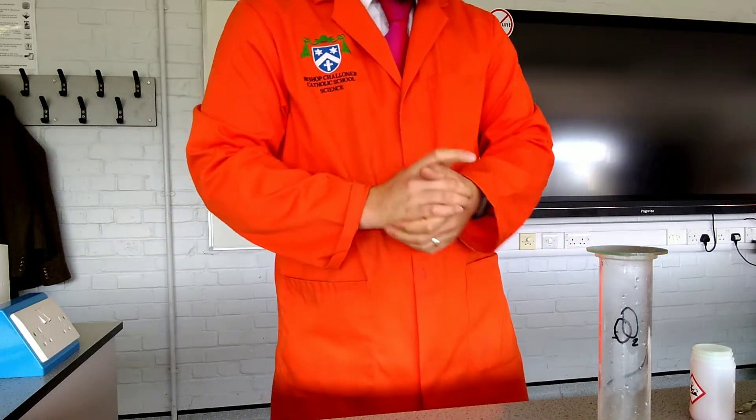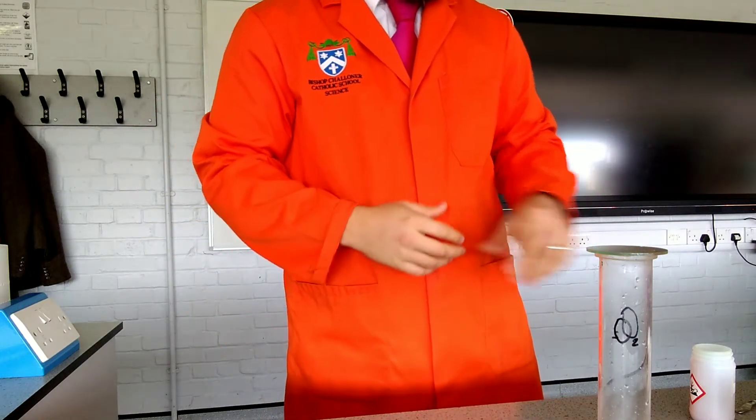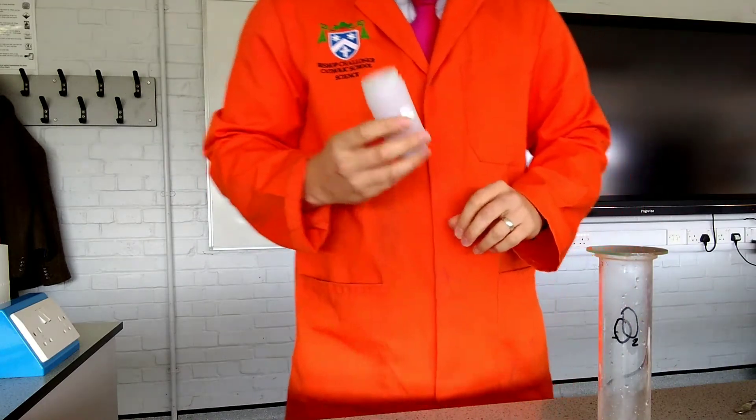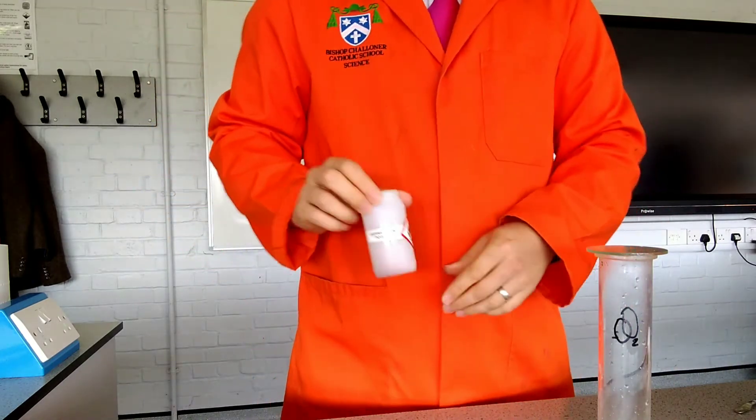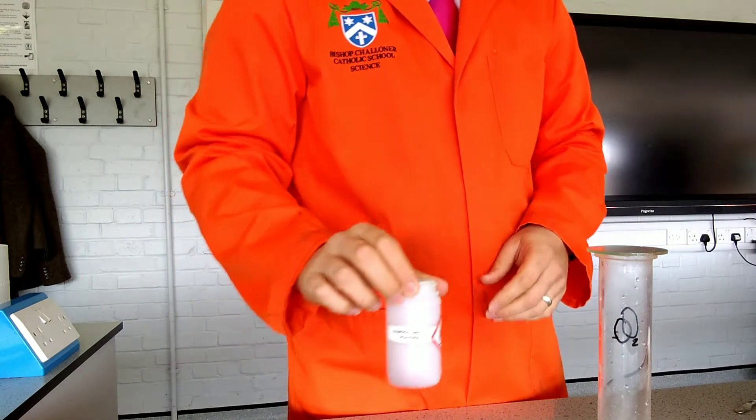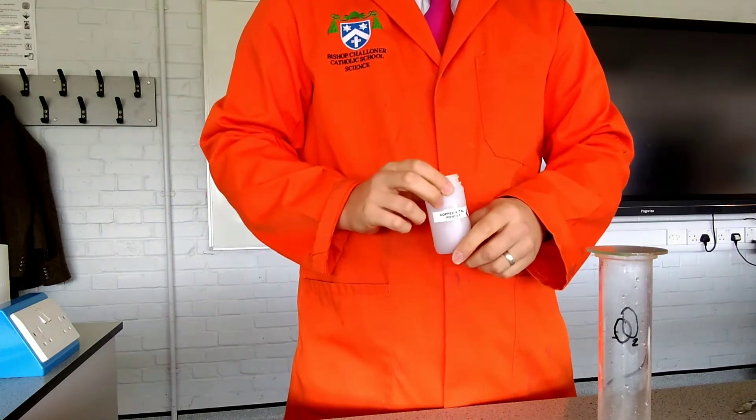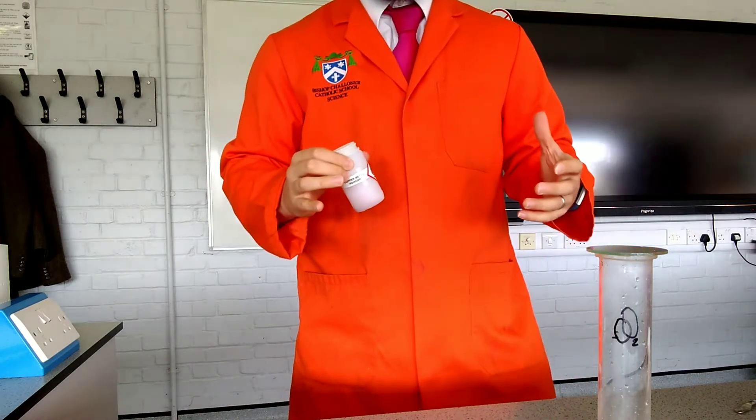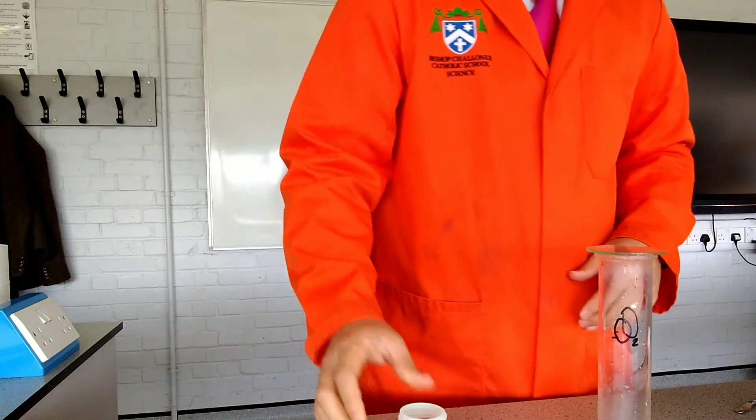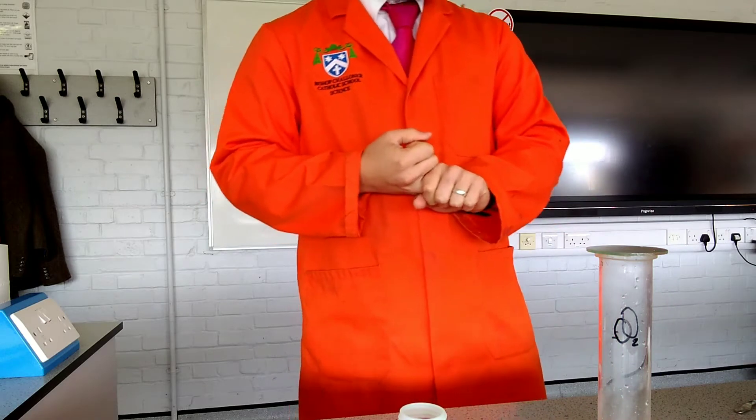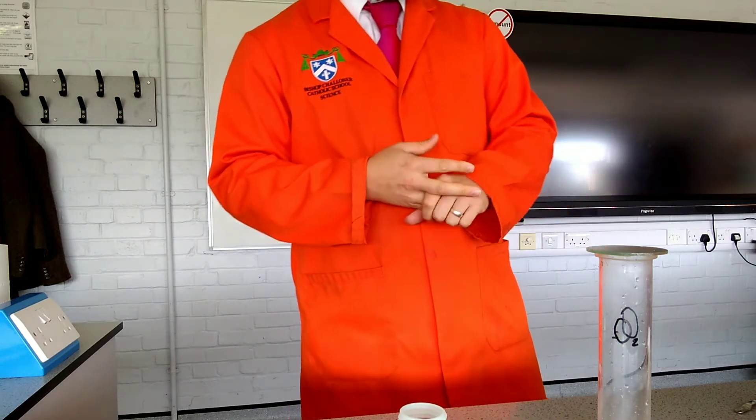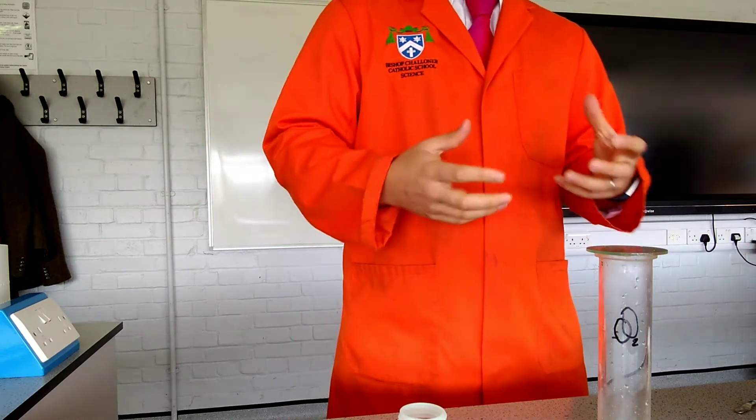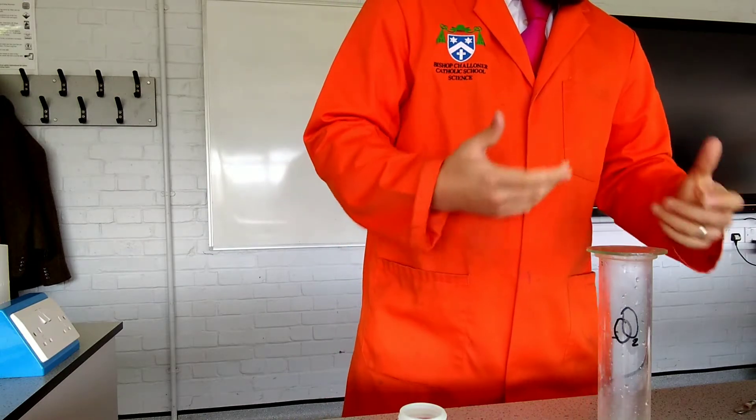In this video we're looking at metal oxides, or creating metal oxides, by burning metals in oxygen. We're going to hopefully come across two things. We're going to come across the differing reactivity of metals, and we're going to use the way these things react to show the difference. And the second thing we're going to do is see some of these things burning in oxygen and observe the reactions that take place and what we end up with.